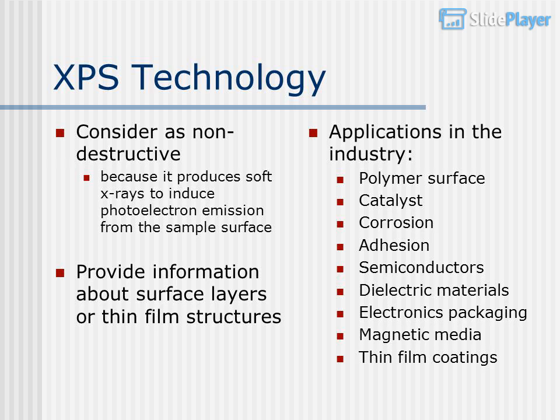Applications in the industry: polymer surface, catalyst, corrosion, adhesion, semiconductors, dielectric materials, electronics packaging, magnetic media, thin film coatings.